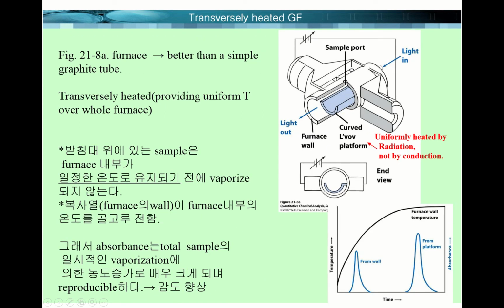This configuration is also a furnace made of graphite, but it is transversely heated. This is the structure of a transversely heated furnace. What does transverse mean?